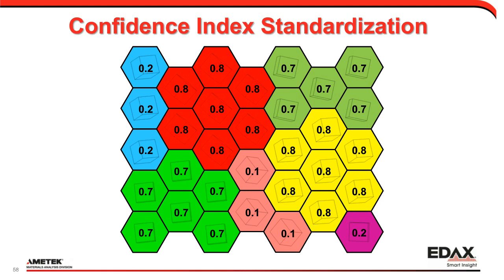And then I have a question here on what exactly a division is doing. Okay, it's actually a really good question. Give me a second to skip back to the slide that shows the difference here. It's quite far back, so a lot of furious clicking going on over here.